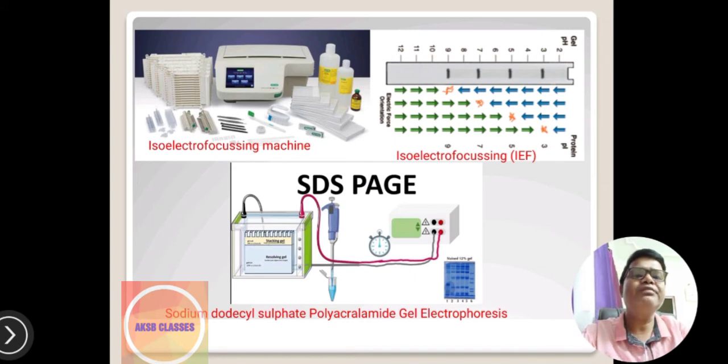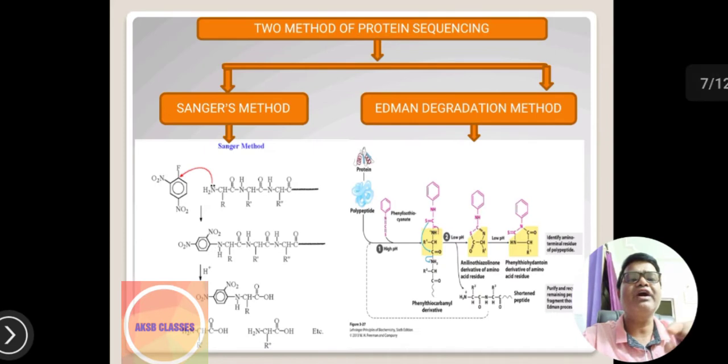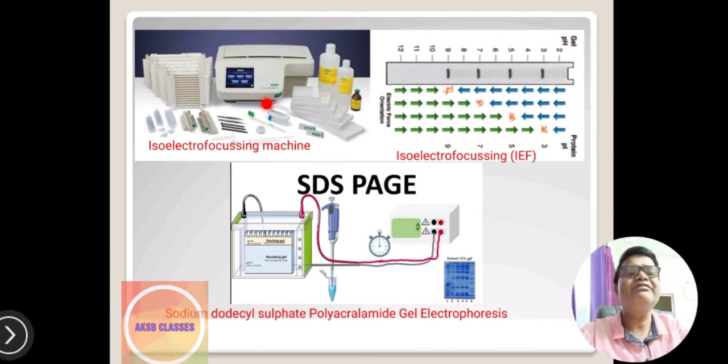With the help of this machine, we will try to find that different proteins have different pI.